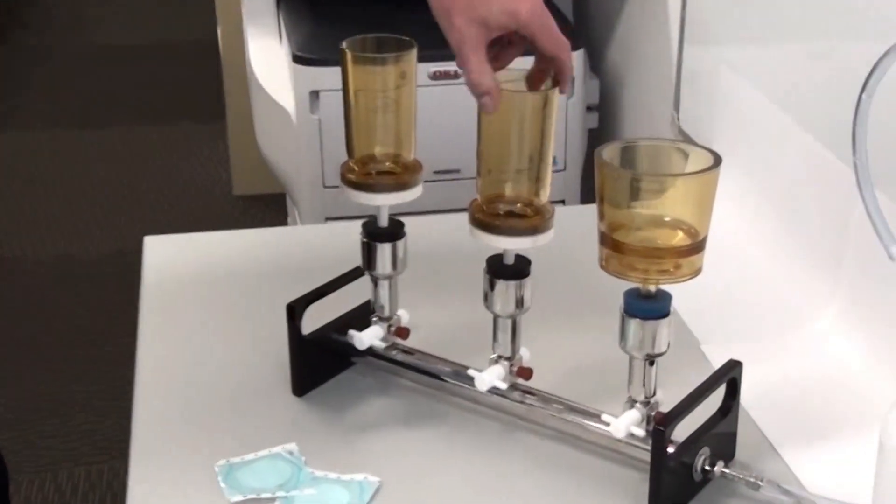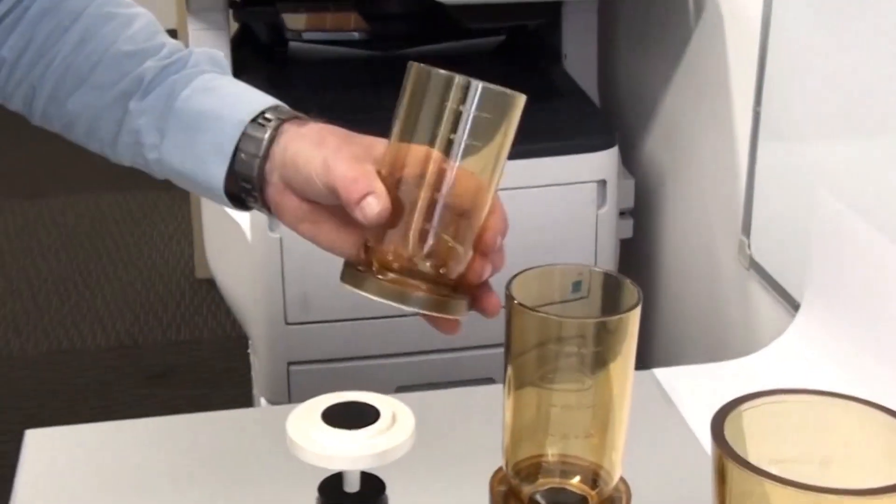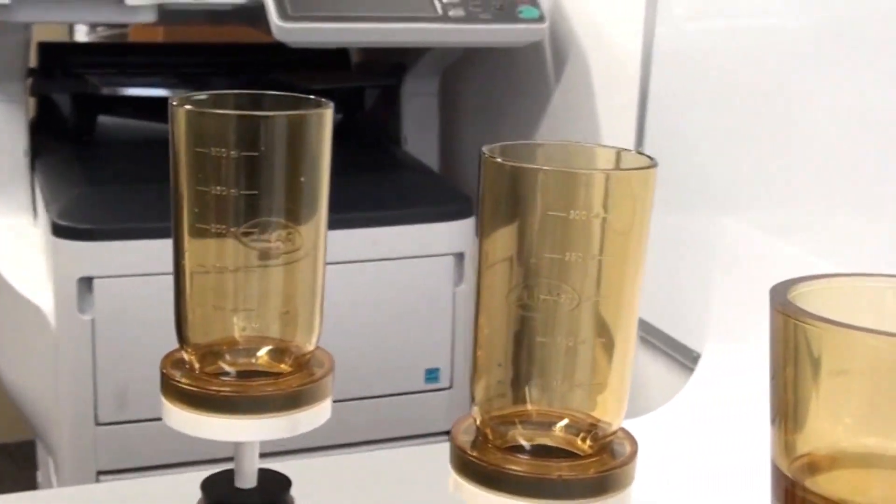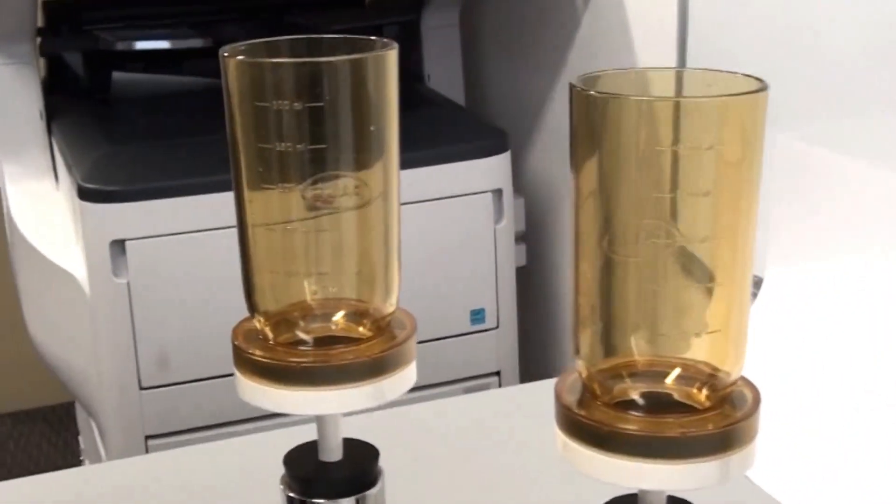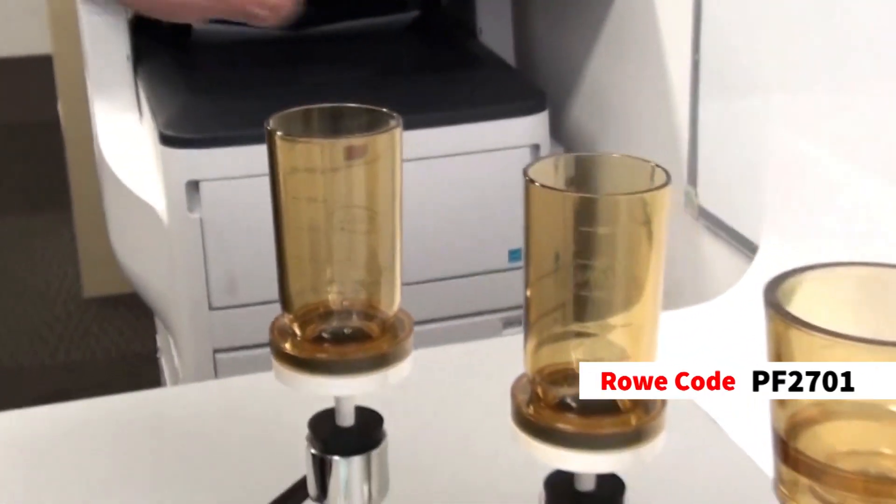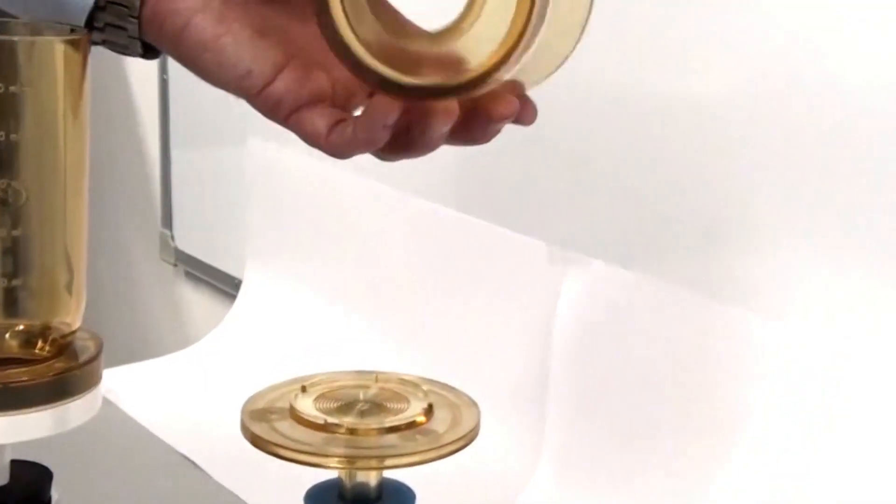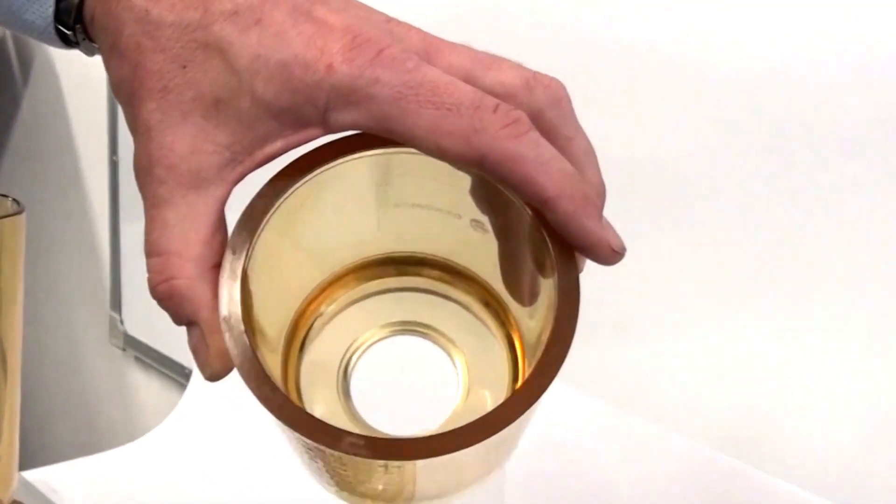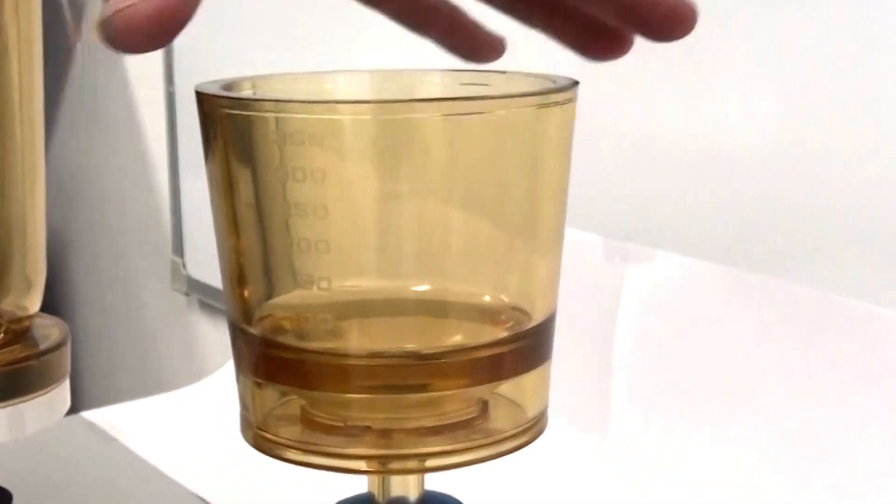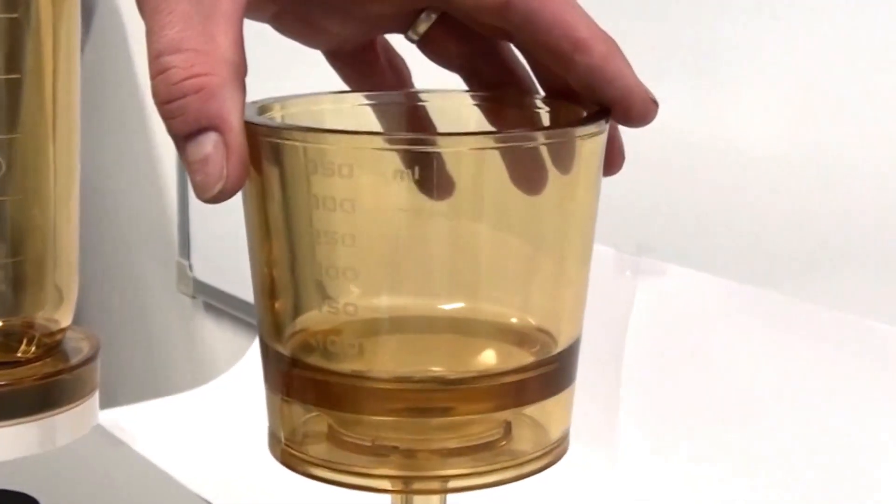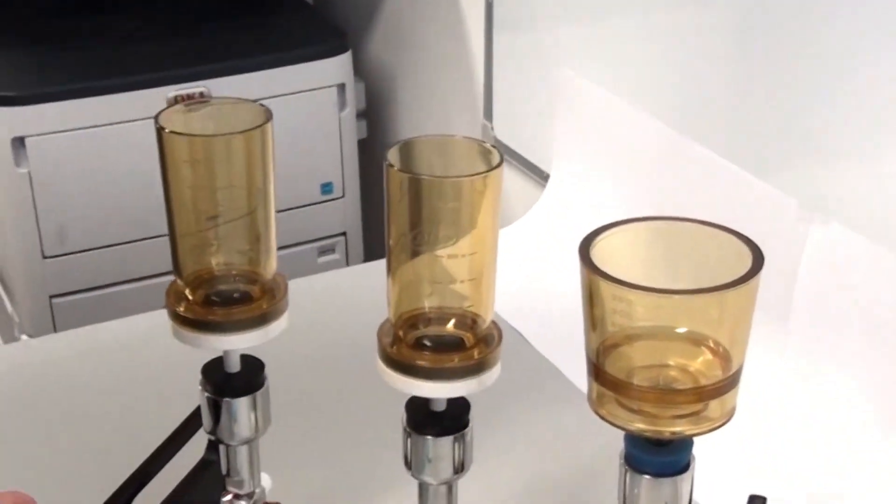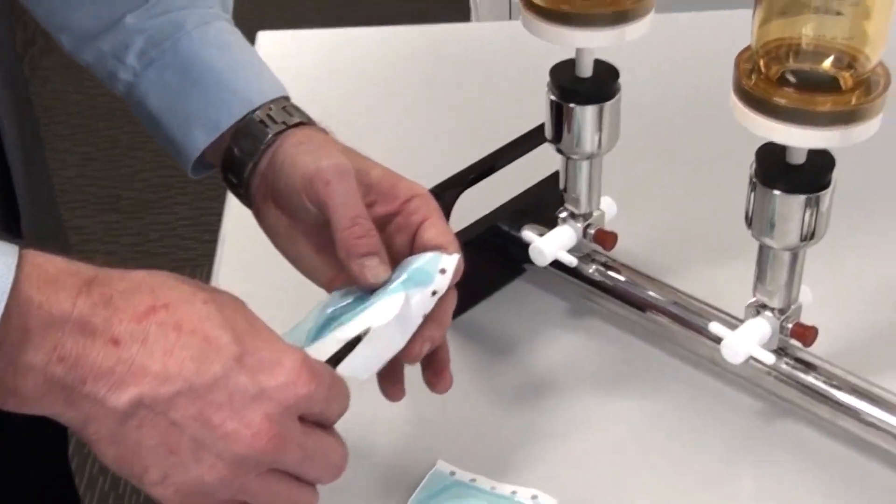Now we've got a couple of different designs of filter holder. So this is a 300 milliliter capacity magnetic filter holder. That's the Pall brand. And our part number PF2701. And the Gravi, this is called a Gravi seal, held in place by gravity alone. So it's a fairly thick filter funnel. There's no gasket, nothing required there. Just the sheer weight pushing down is enough to ensure that there's a nice seal. And that's our part number PF1180. So let me load up with a few membranes and we'll run some water through. So that's the magnet holding that together. So these are all stocked in our Perth warehouse.